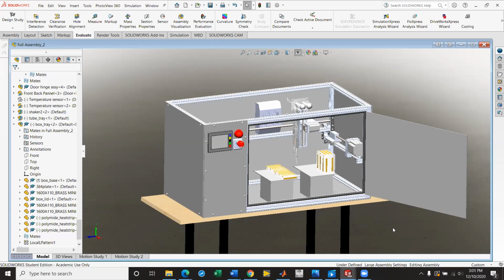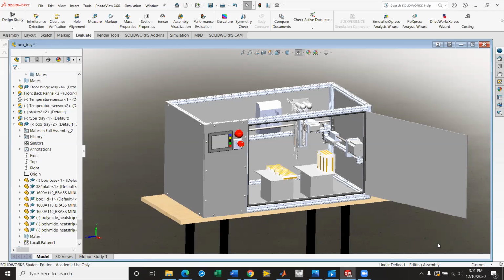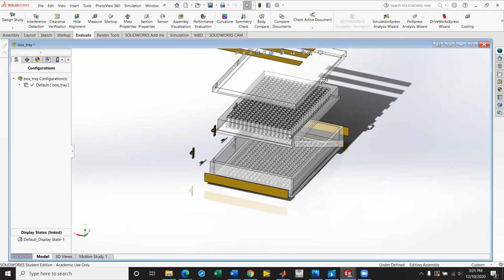Right, but okay. So I've got a 384 well plate. If you can visualize this, I can have an LED underneath each one of those 384 wells, so I can do all of those individually. That's your LED array. But now if I've got a 6 well plate, I'm going to have dark spots in that well where it's not going to be properly illuminated, because I'm not diffusing my light effectively, or I don't have a perfect circle. Things aren't going to line up correctly.